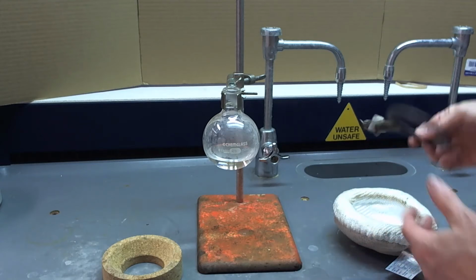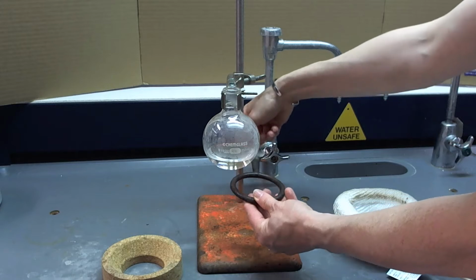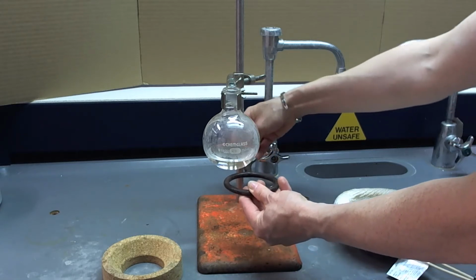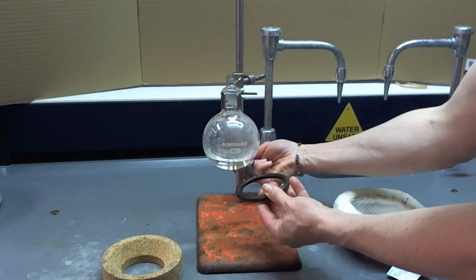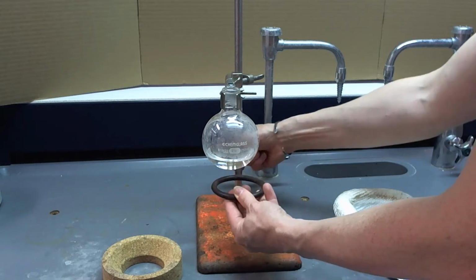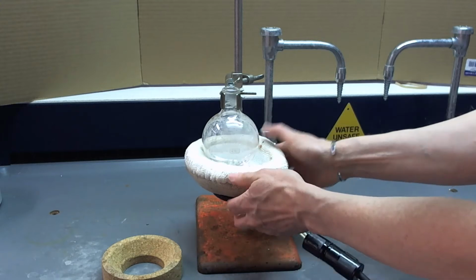And next up, we're going to support the heating mantle using a ring clamp. Now, we don't want to rest the heat right on the floor of the hood. We want to have it elevated a little bit. And that's how we're going to prop it up using the cork ring. I'm sorry, the ring clamp, like so.